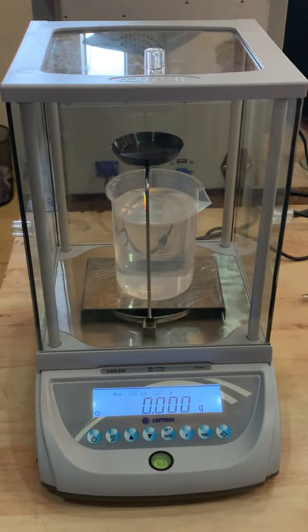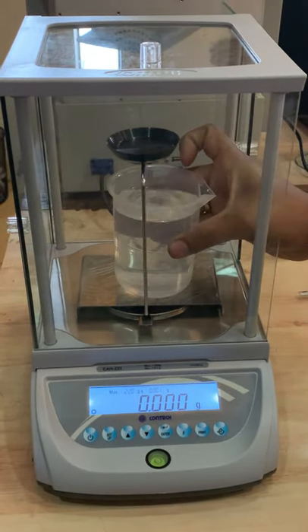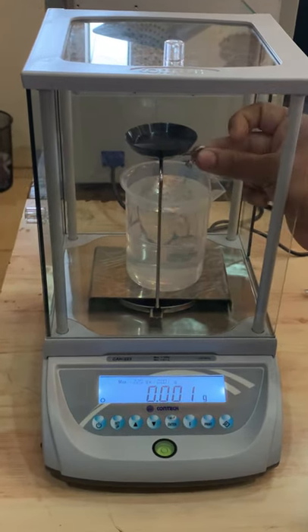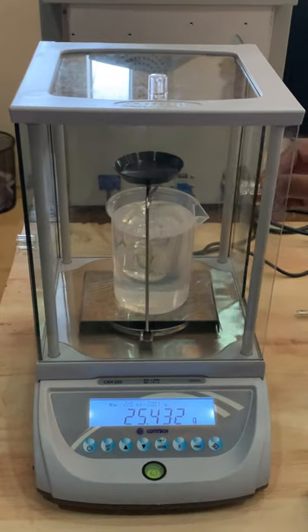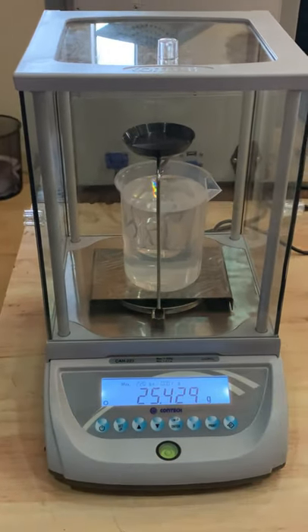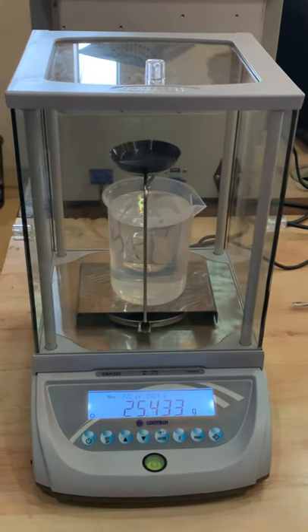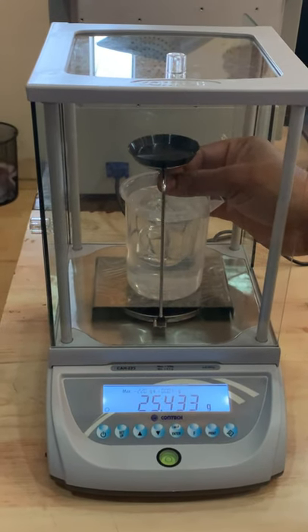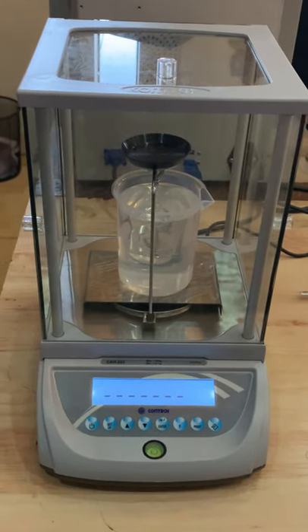Now bring your new beaker — a liquid beaker — and keep it here. This is an example; you can bring any liquid. Dip the hook in the water and liquid. What I will show you now is only for the first time, not every time. After this is finished, you can just bring your beaker with whatever liquid and put this hanging piece into it. Wait for stability and just press enter for the density reading.